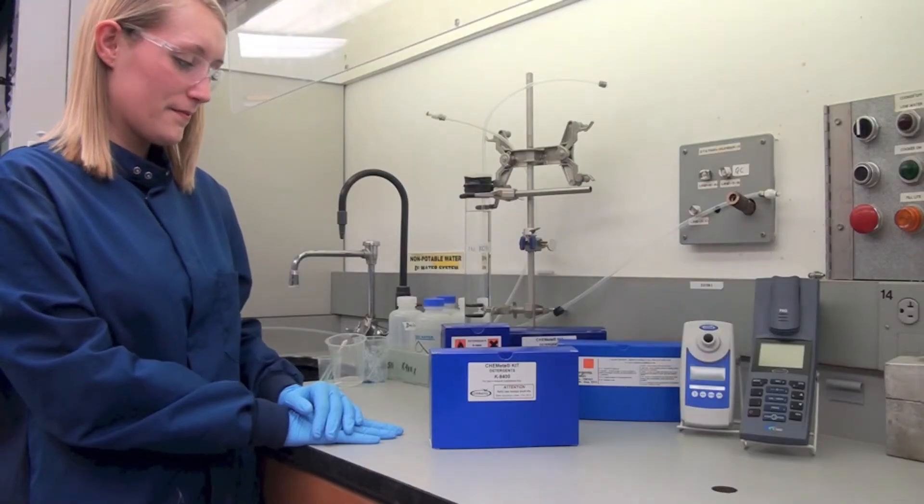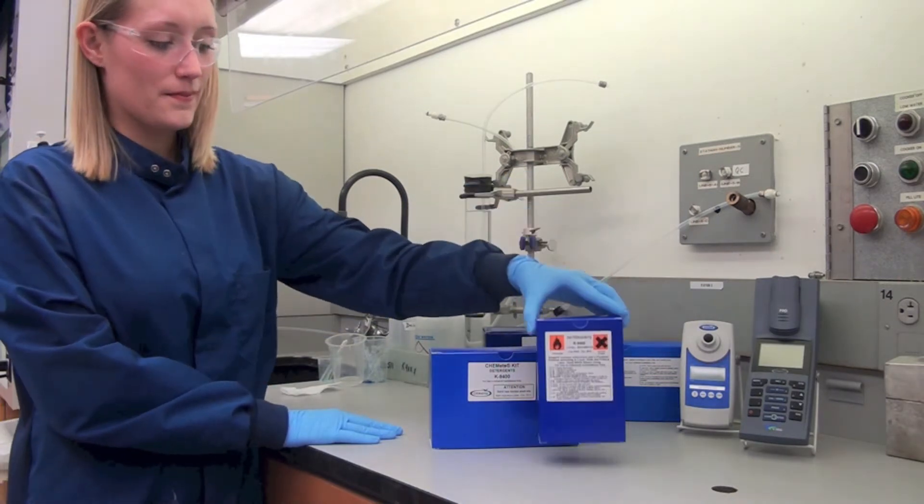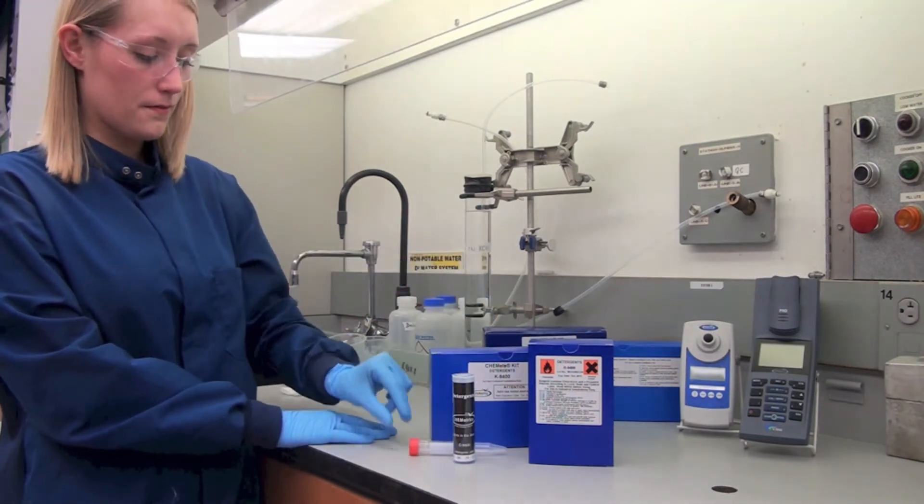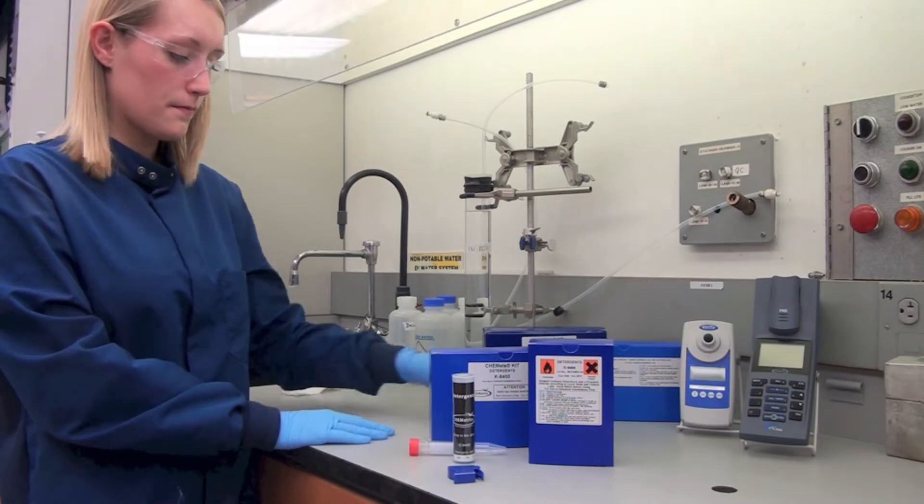Each detergent kit contains everything needed to perform 20 tests: refill, comparator, reaction tube with lid, tip breaking tool, and instructions.